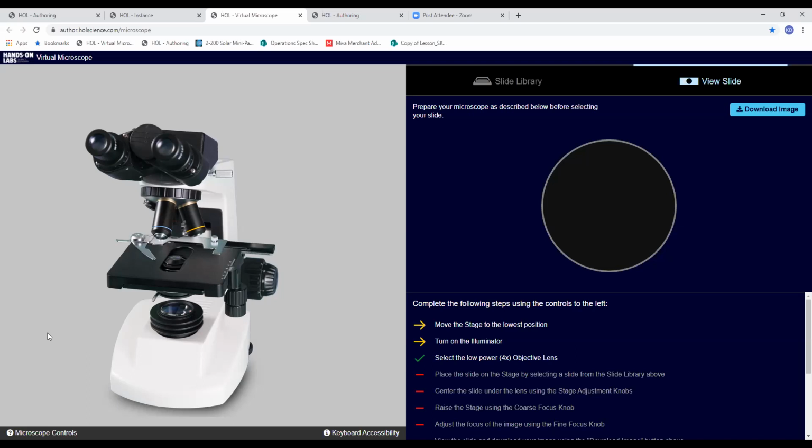However, if your main concern is that students just learn how to focus and download captured images, then we have built a digital/virtual microscope that is available throughout our curriculum. And if you elect for your students to use that, it will appear on that drop-down tab menu that I called up just now, just like it has for us here in the demo.